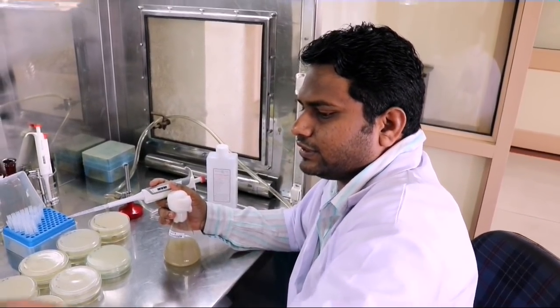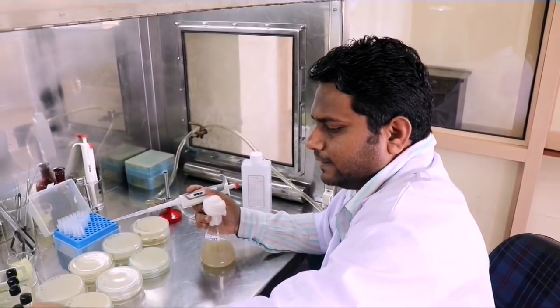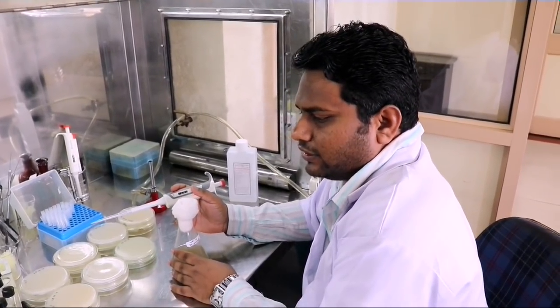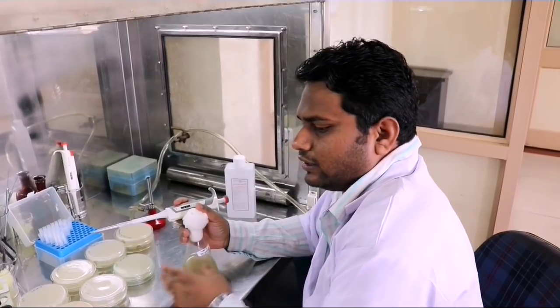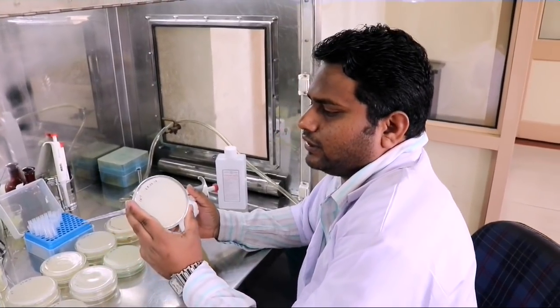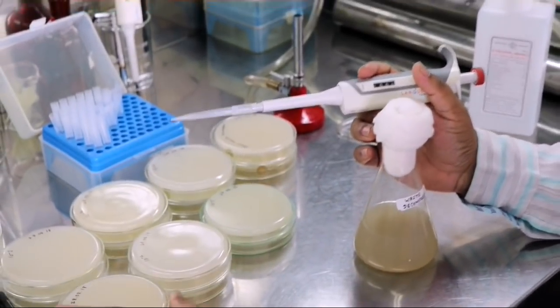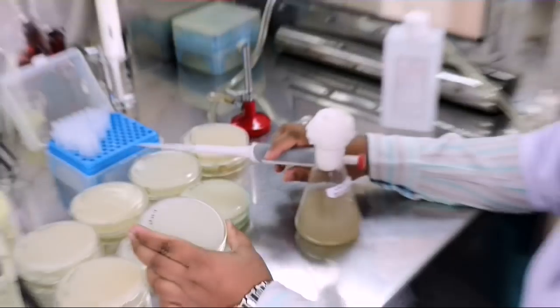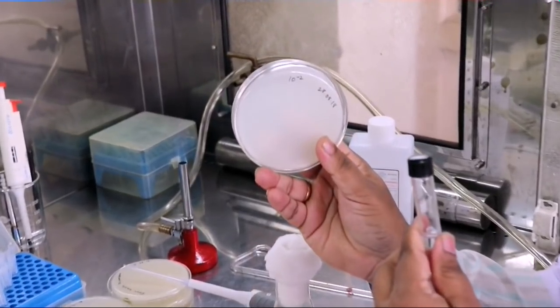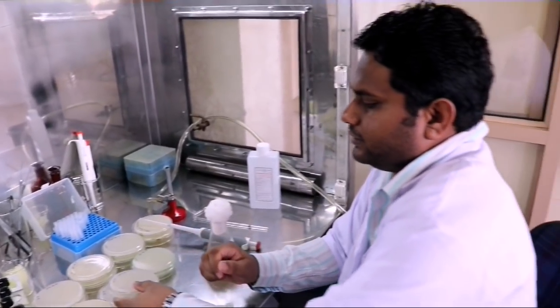We have labeled the tubes as 10 to the power of minus 1 and 10 to the power of minus 2, and so on. We will take from the stock culture, make a serial dilution, and then add the aliquots to the corresponding labeled plates — 10 to the power of minus 1 and 10 to the power of minus 2.